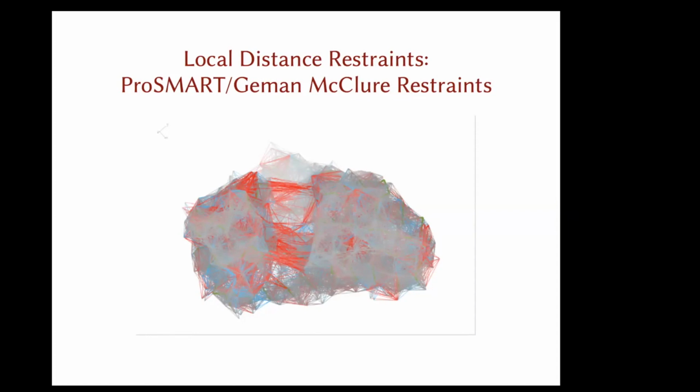The color red in Coot is typically used to mean error. That's not what I'm trying to represent here. So I've changed the color scheme to green to purple, which is less problematic. You don't look at the color red and think, oh, that's a problem. So it's just longer or shorter than the reference, and it's not wrong that it's longer or shorter. It's just useful information. And as you progress with the refinement, these colors dynamically change.